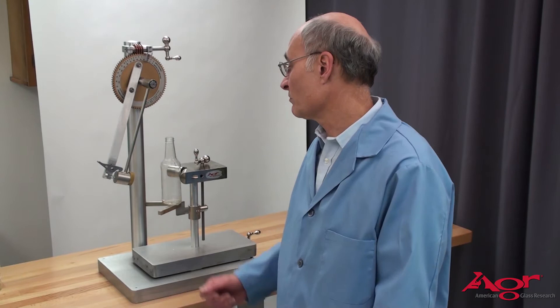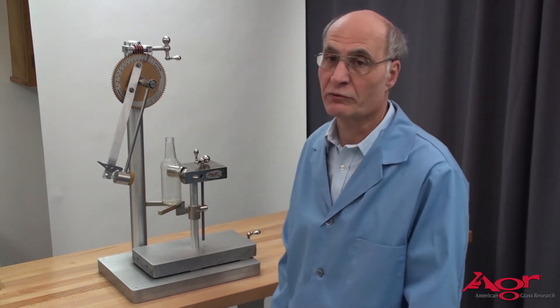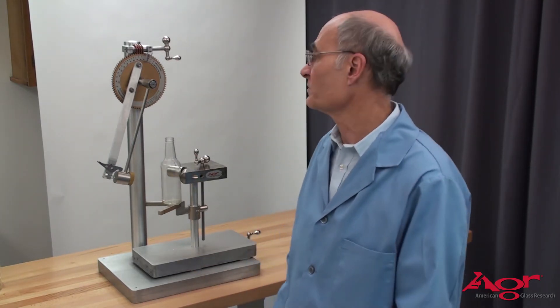On this sample, we have a bottle that has a more severe defect than the last sample, so we'll repeat the testing on it to determine the breaking level.